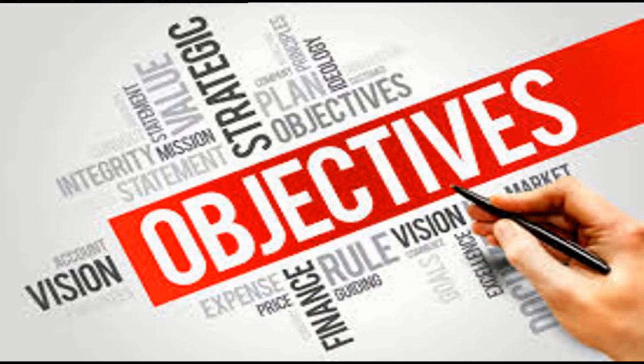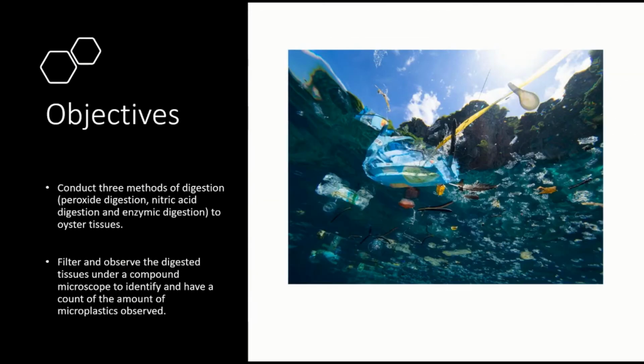So my objectives are to conduct 3 methods of digestion, which are the peroxide digestion, nitric acid digestion, and enzymic digestion to the oyster tissues, and to filter and observe these digested tissues under a compound microscope to identify and have a count of the amount of microplastics observed.